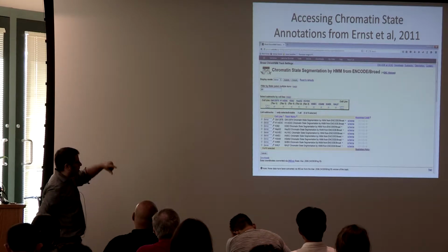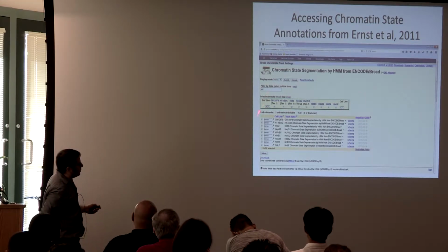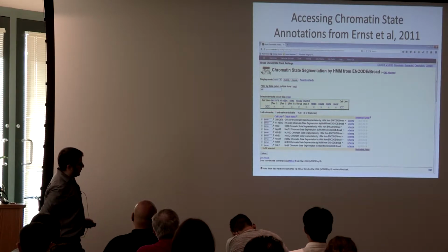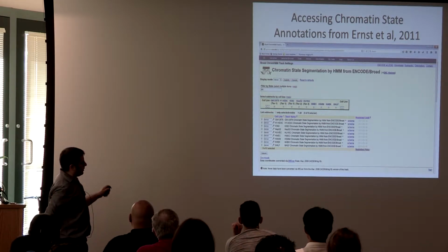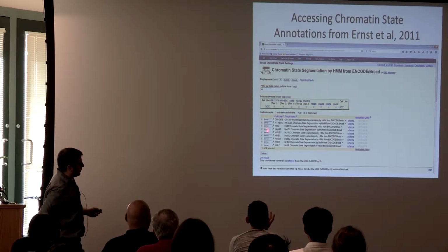If you expanded it out, you could get potentially different state calls in different cell types. I tend to like it in dense mode, except sometimes I've colored 2 states that are similar the same color, and if you wanted to really differentiate them, you might need to change the mode to see that.